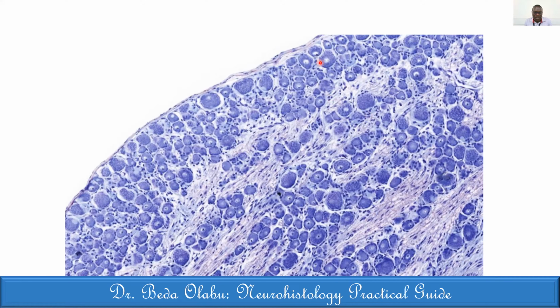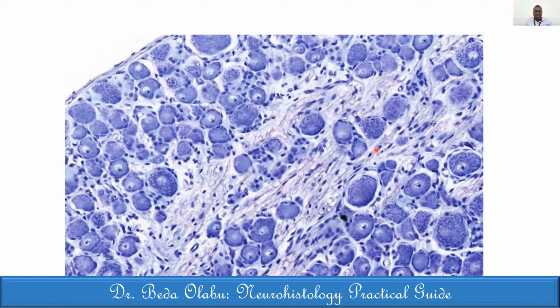So we have several cell bodies of neurons within this particular zone, interspersed with a lot of fibers, and the whole structure is encapsulated. Look at that magnification. You confirm the presence of an open-face nucleus, a large euchromatic nucleus with a prominent nucleolus. Then we have fibers interspersed.